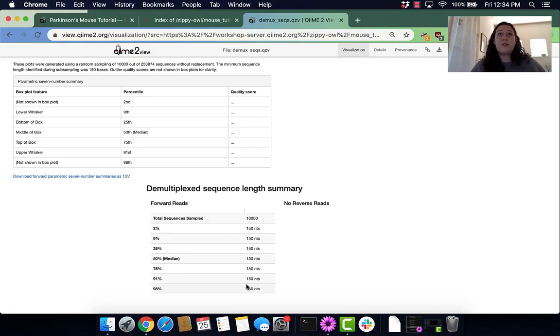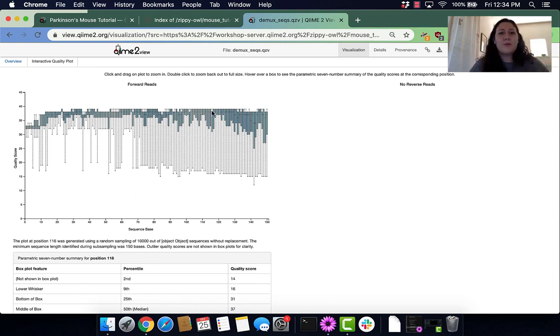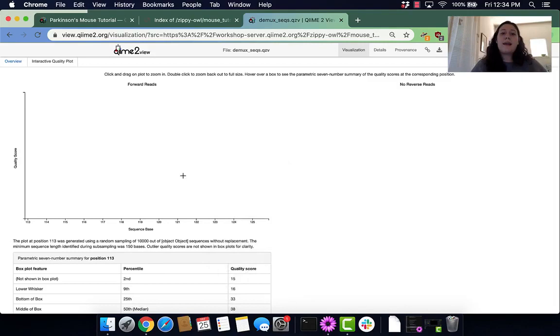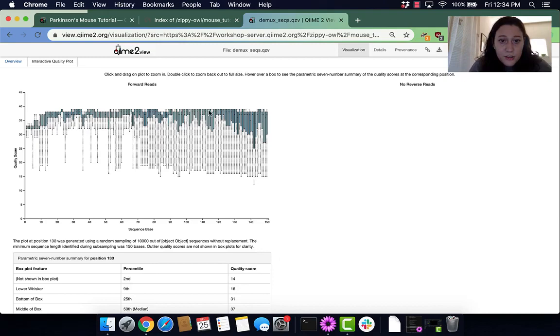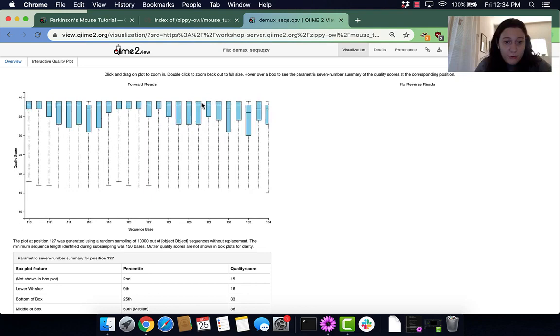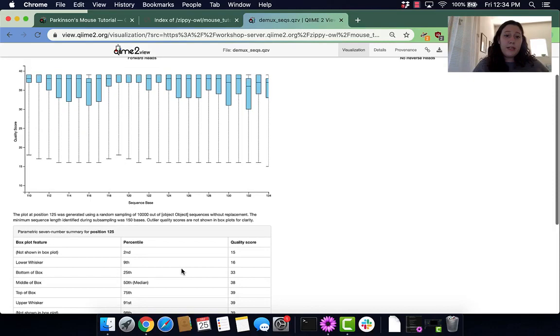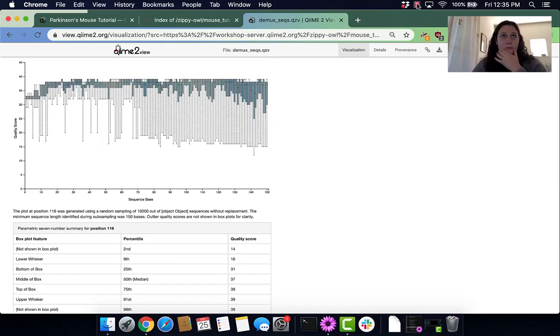Our next question is, what is the median quality score at 125? I'm going to zoom into a little bit of this so I can get a better view of 125. To back out of a zoom, you double-click on the graph. This is sequence 125. If we look at our plot, we can see that sequence 125 has a median of 38.